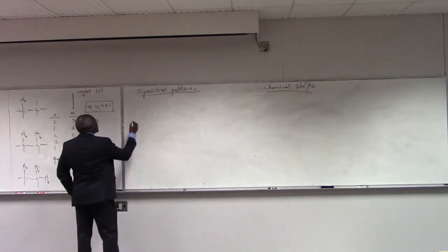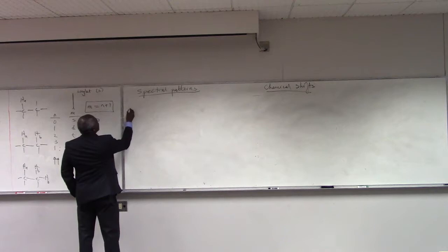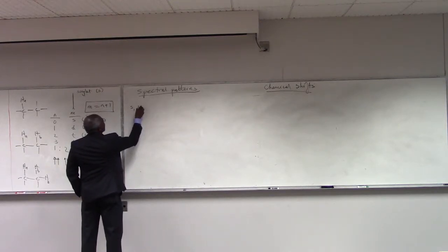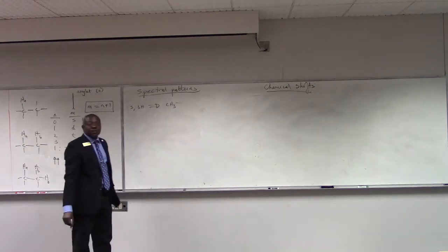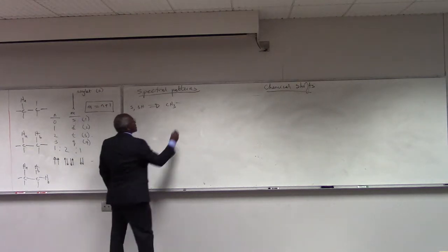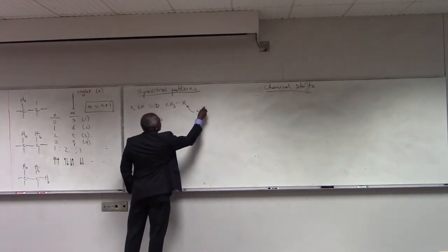And so if I see a singlet for 3 H's, that screams CH3, right? That's fairly straightforward. What it also says is that whatever is here has no hydrogens.